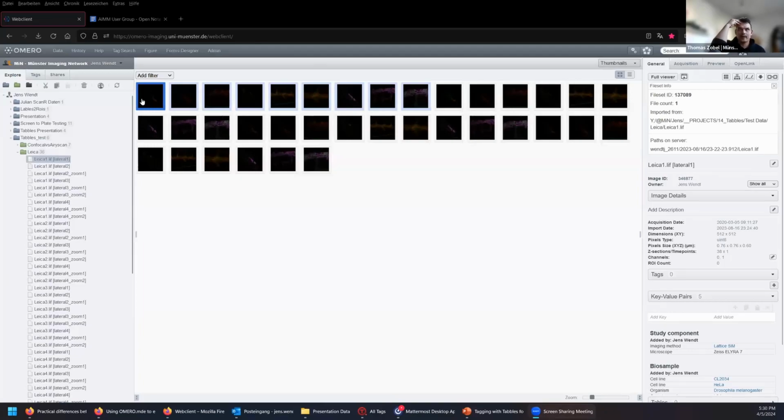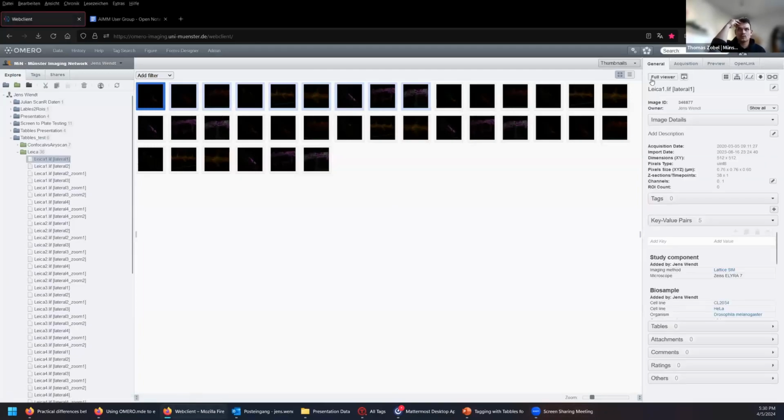I'm pretty sure if you can see it and can right click it, because you're not changing the actual file, you're just creating an entry in the SQL database. Okay. I didn't try it, to be honest, but I can maybe answer the LIF file question. Can I share the screen again? I guess with the LIF files this will not work, because Tables is made for files on the computer. So the LIF file is one single file, and you will tag this single file. Yes, and then you will not have it. Yeah, that's what I was thinking.